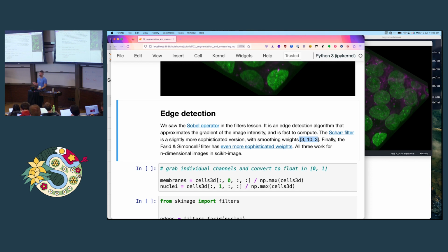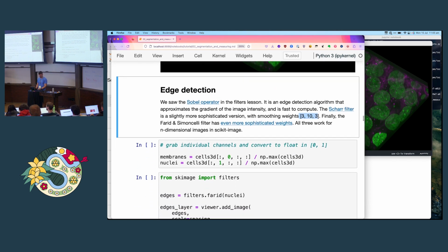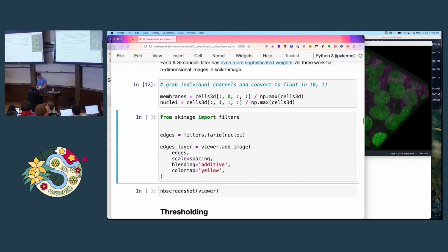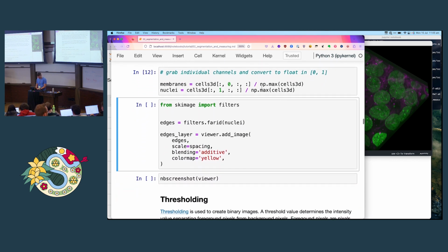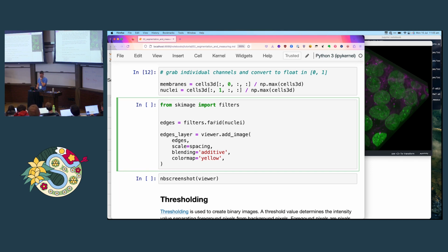All right. So we do a median filter, which again we saw, and we want to use it because it's edge preserving. And then we're going to use one of the threshold functions built into scikit-image. I think I also need to import this. Okay, so this threshold function will return one value, and then we just want to compare our denoised image to that one value.